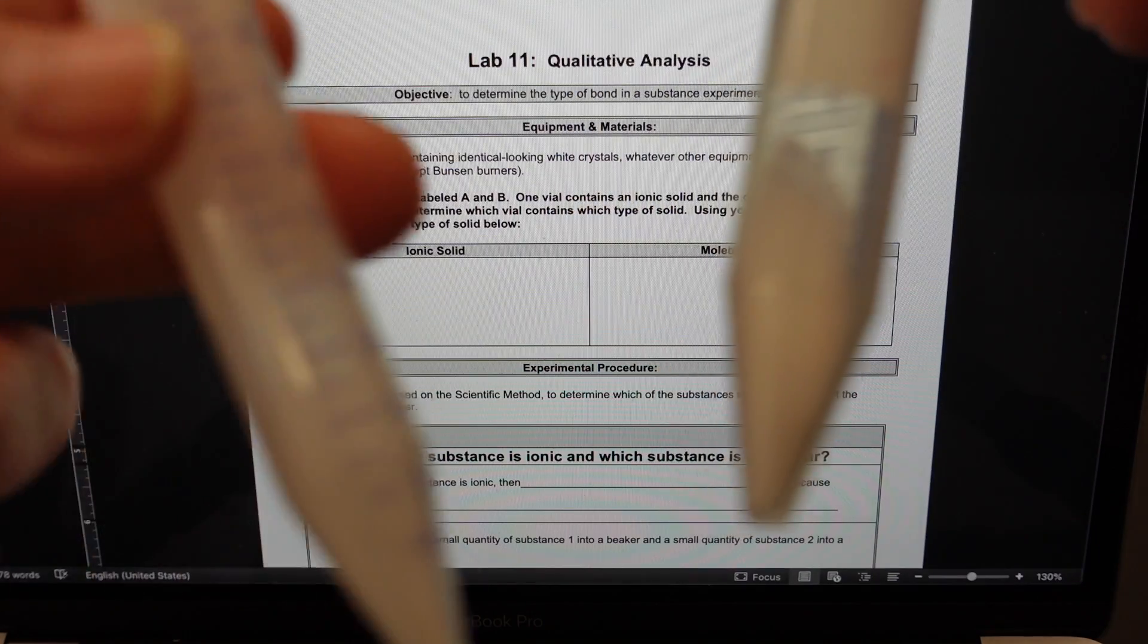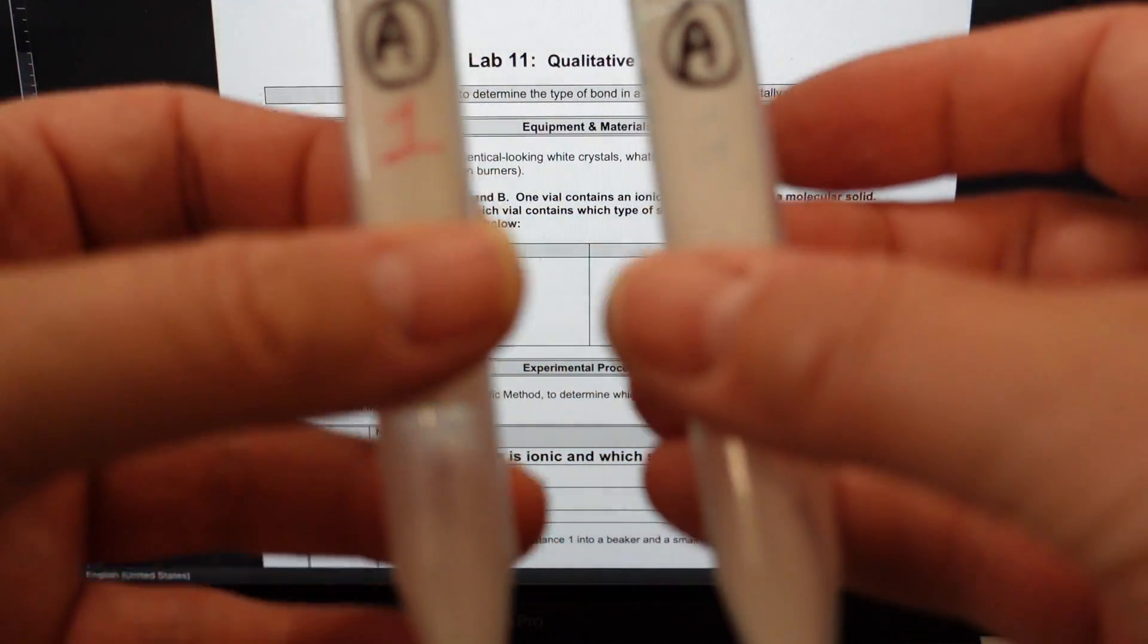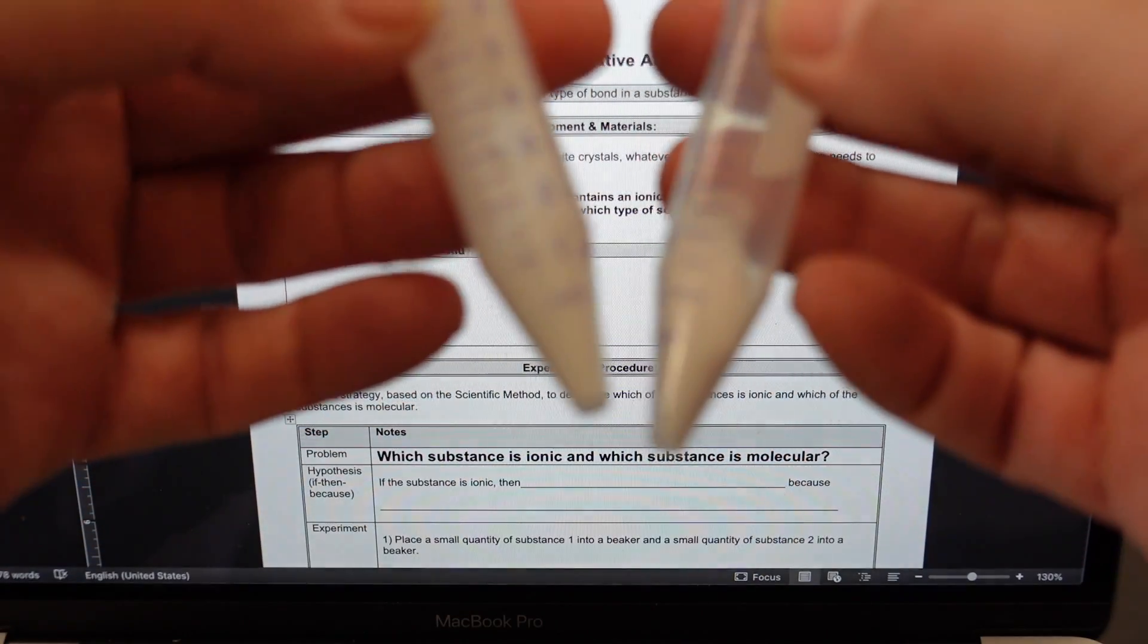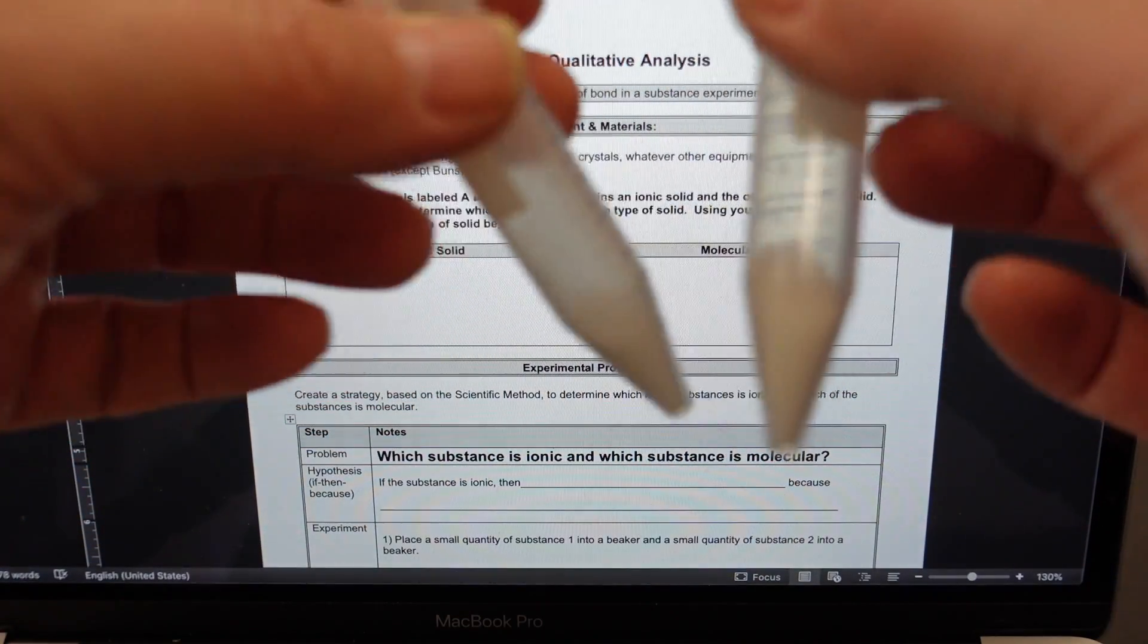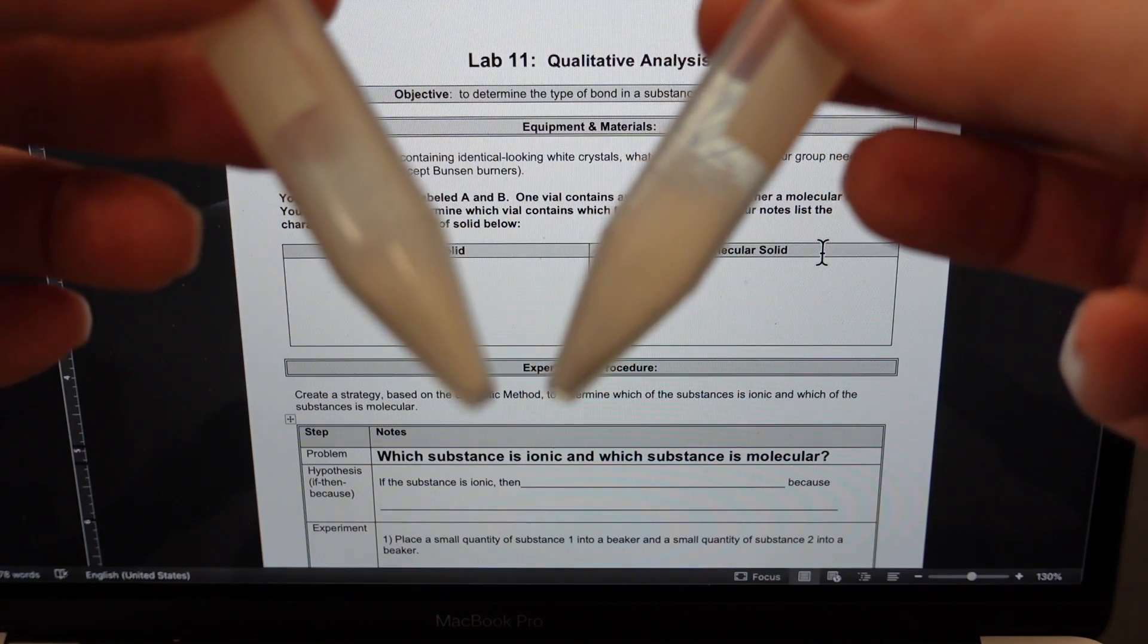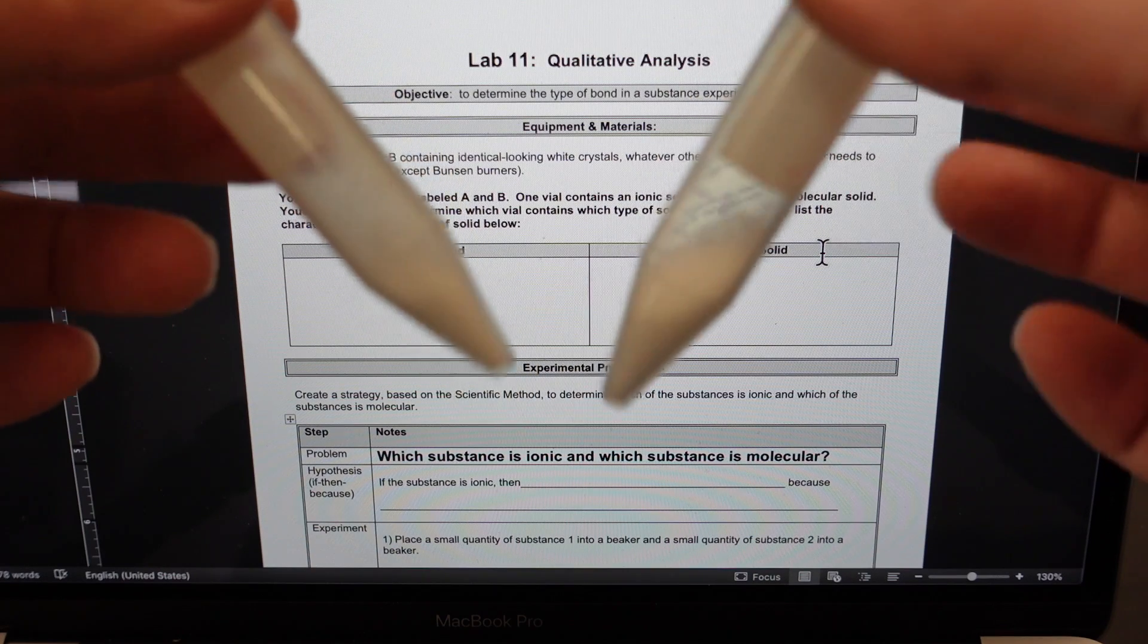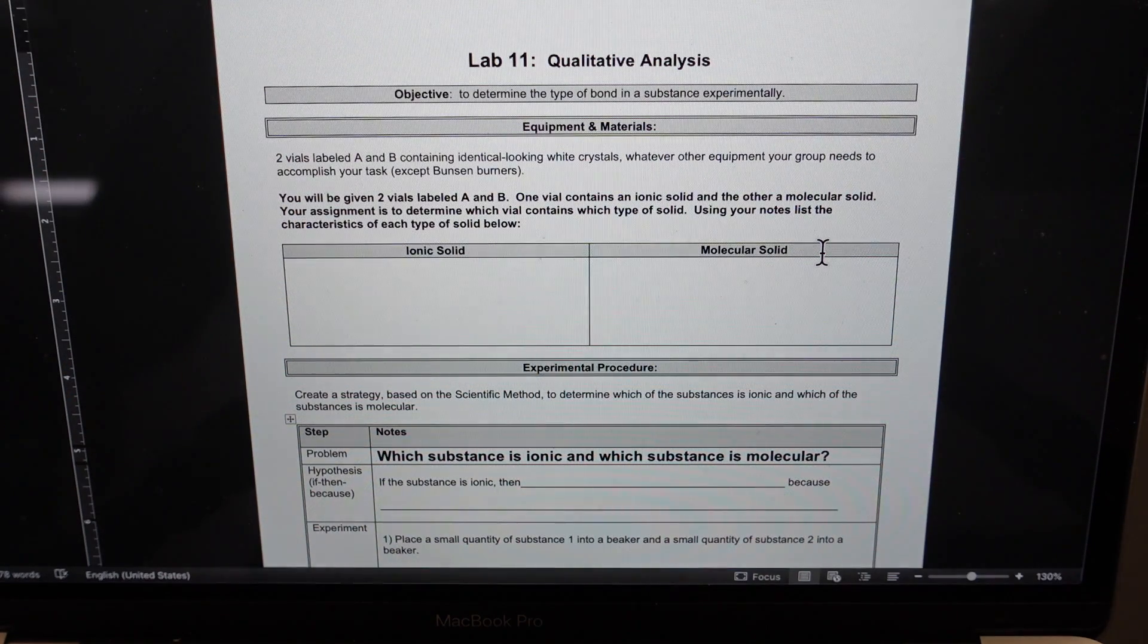So here's the deal. I have two tubes. I have tube one and I have tube two. And in each of these I have a nearly identical looking white crystalline solid. One of them is ionic, the other one molecular. More specifically, one of them is sugar and one of them is salt.